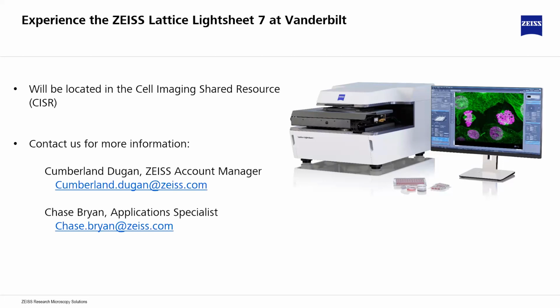So I take it you need fairly bright structures to even do that, right? Because everything that you show is like the brightest things. Right. No, the examples that we show are a little bit cherry picked. They look really nice because they're really bright. But that's not to say that this system can only work with bright samples, especially having moved to the Hamamatsu Fusions.